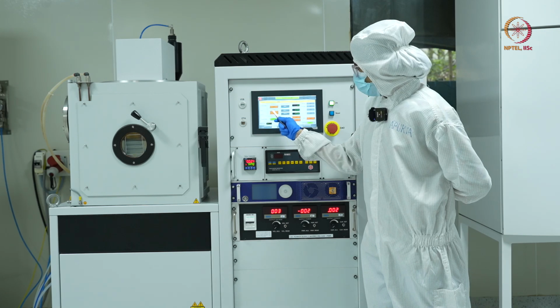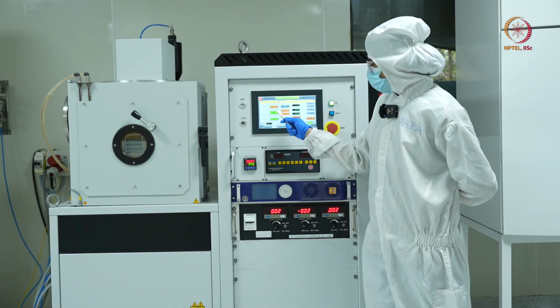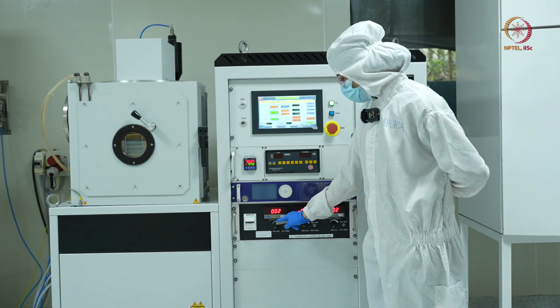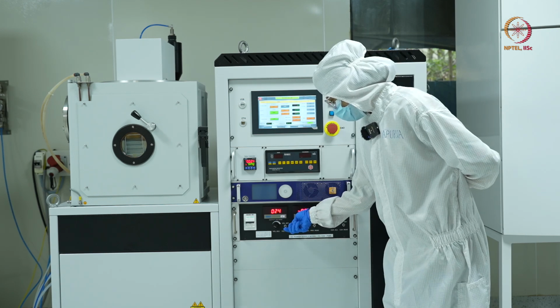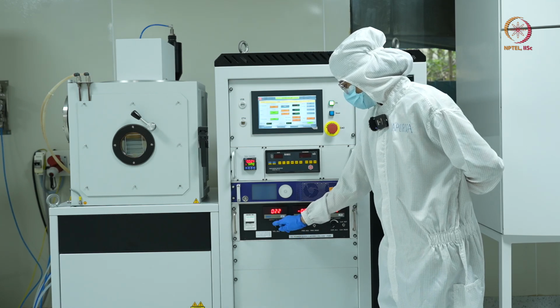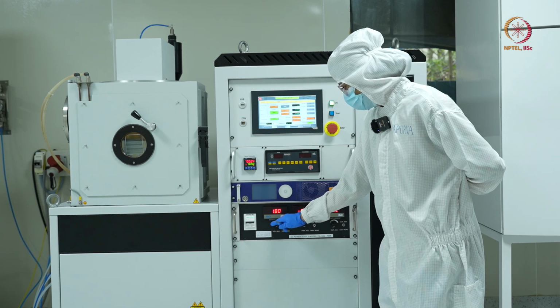This is the argon flow. I'll open the valve for the argon flow. Now I'll increase the voltage to 600 volts. First, I should set this toggle button to the set mode, and I will set my voltage to 600 volts.